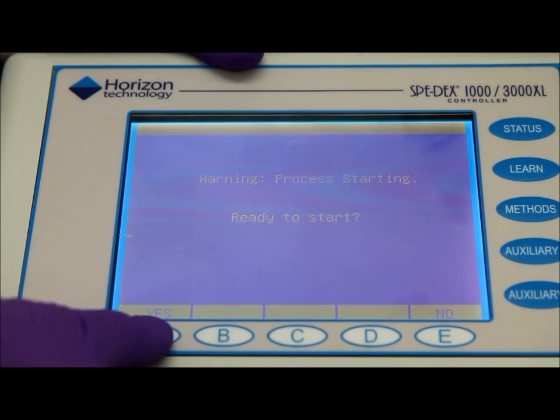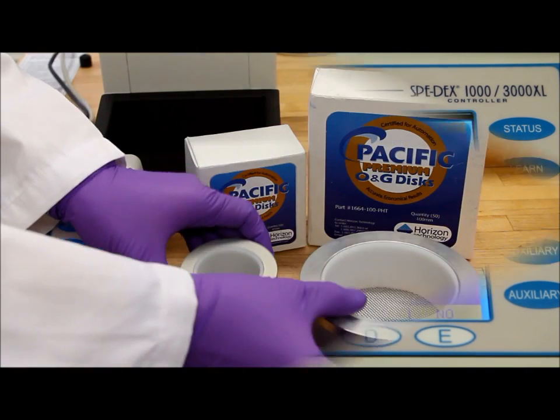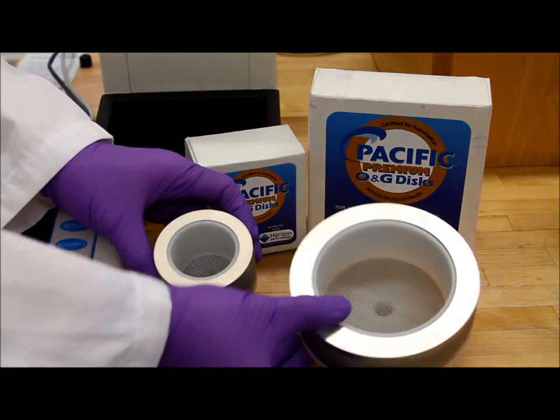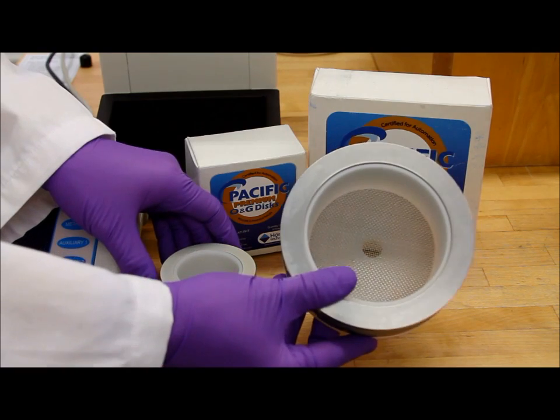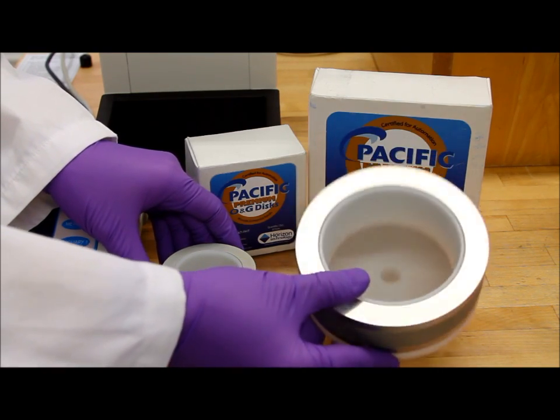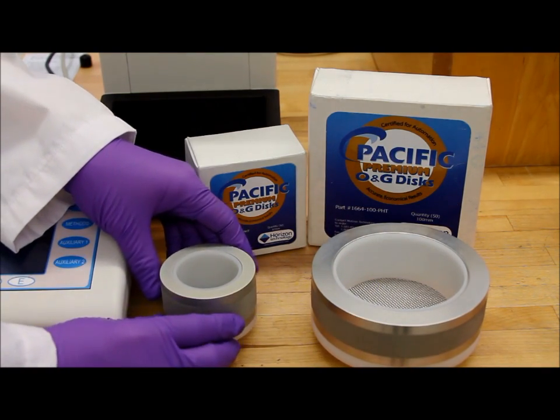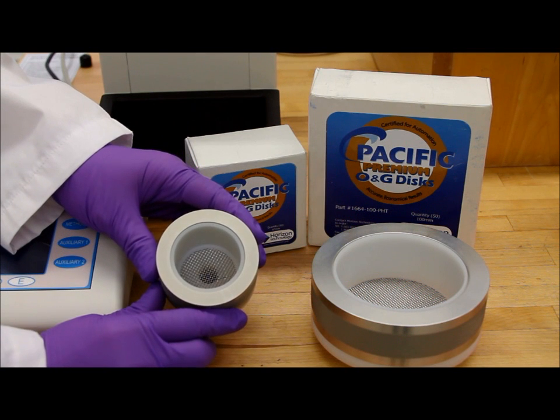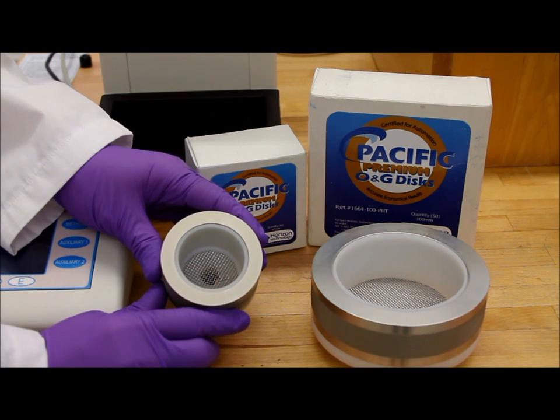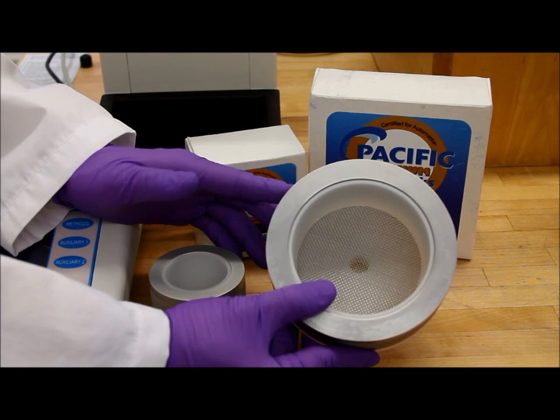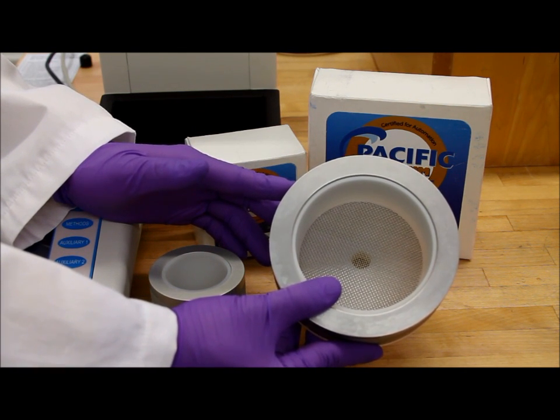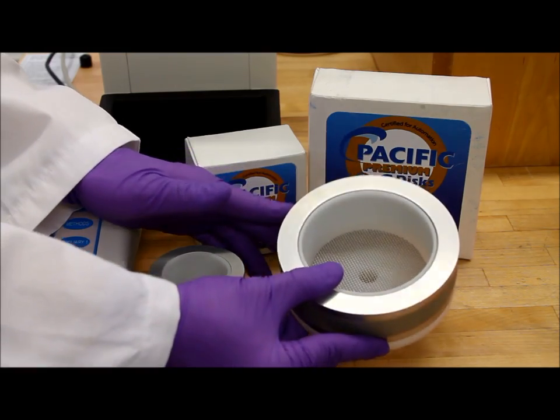So here are our two SPE disc holders. This is a 47mm holder and this one is a 100mm holder. The difference between the two is that the smaller disc holder is more suitable for clean samples, whereas the bigger disc holder can take care of high particulate samples such as influent waste.